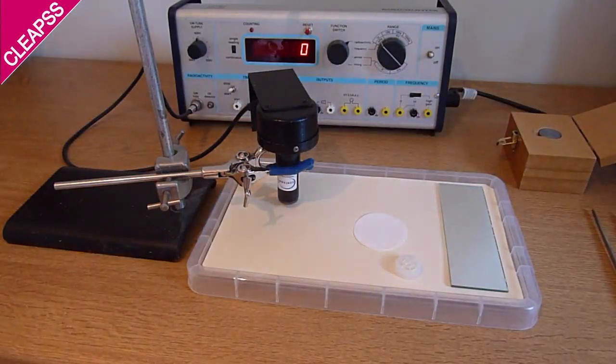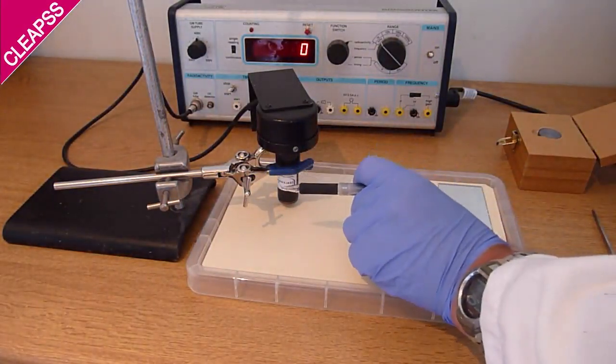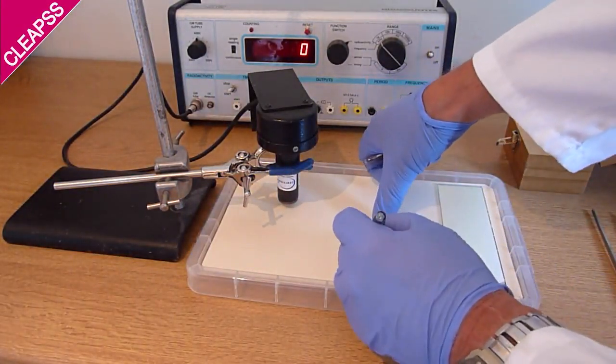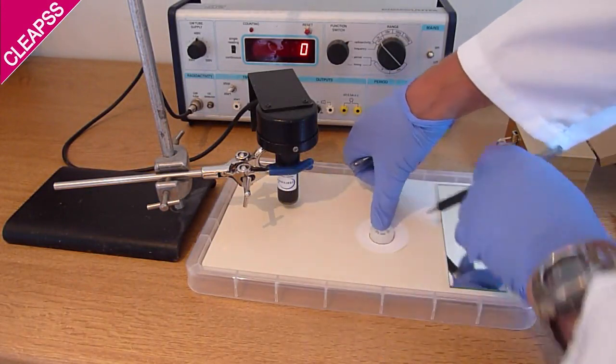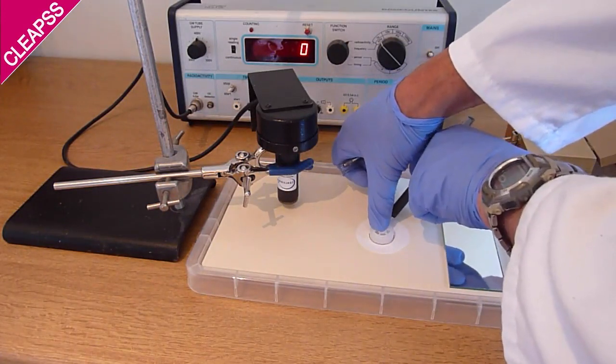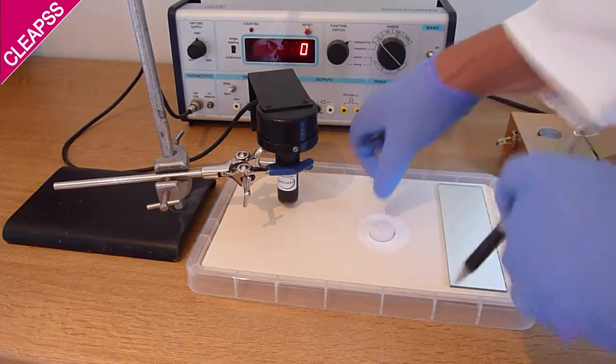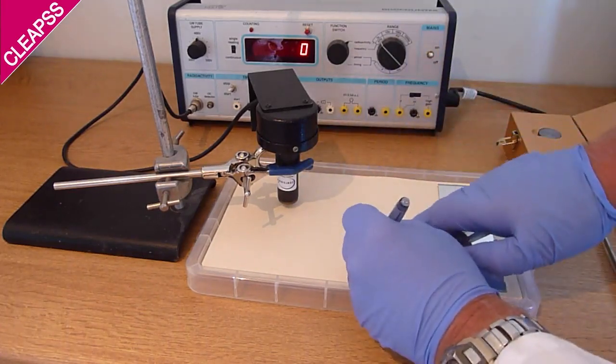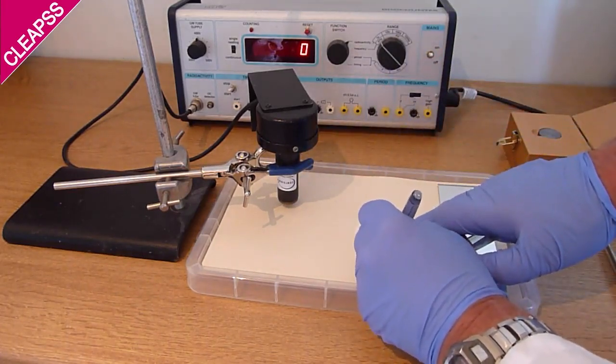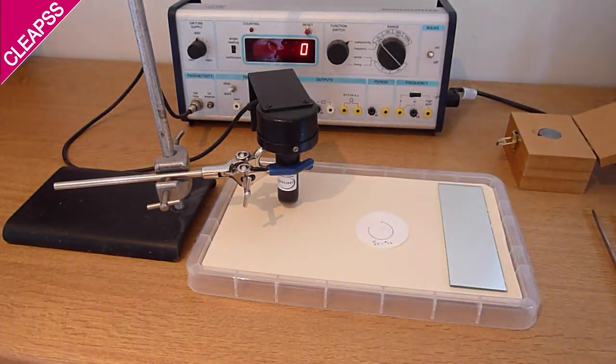And now to the leak test. Draw a 20mm diameter circle onto the filter paper. I use the GM tube cap to do this. Label the wipe with the source you are about to leak test.